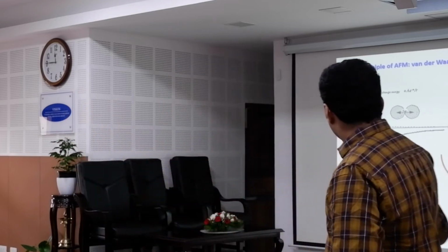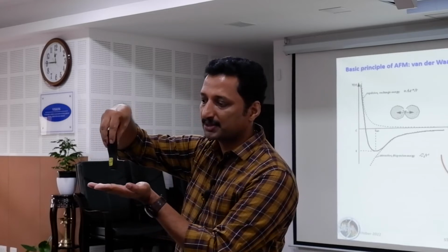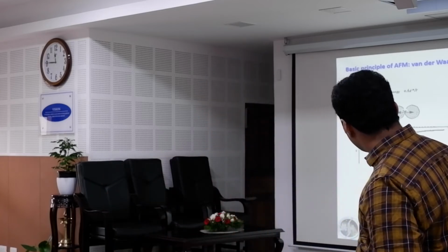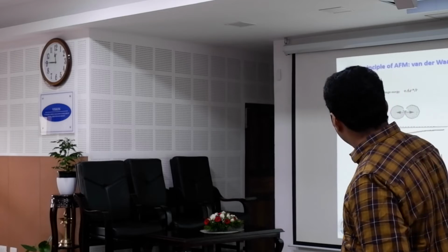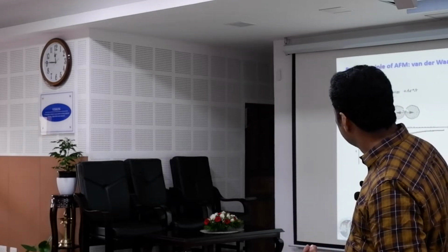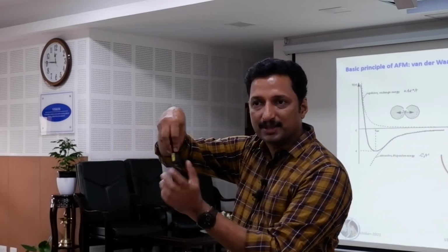Okay, but there is a problem with the contact mode. Contact mode means when the tip comes closer and closer, you see we are in that attractive regime. Now what happens? The tip will jump into contact. Okay, this is the jump. So it will jump into contact because, look here, the tip is coming closer and closer, and it's like an attractive regime. So this attraction increases here. The tip will electrostatically jump into the contact. And once it jumps into the contact, it is not easy to pull it back, because now it is like a glue. It is now glued there, because now the tip atoms and the surface atoms are in contact.